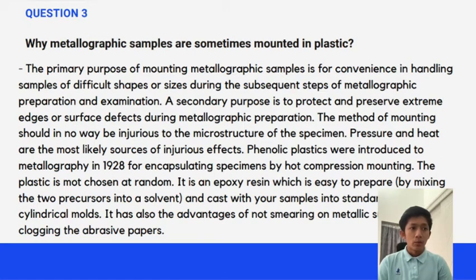Phenolic plastic was introduced to metallography in 1928 for encapsulating specimens by hot compression mounting.